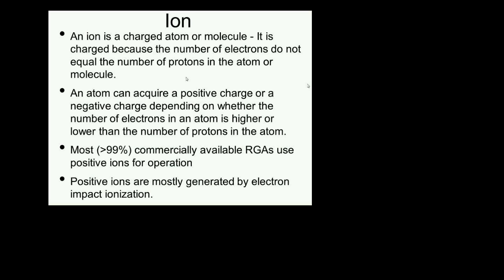Most residual gas analyzers use positive ions, so we're only going to be talking about positive ion residual gas analyzers today. But be aware that you can actually buy residual gas analyzers that rely on negative ions as well, which could be a useful thing if you're trying to study electronegative molecules.